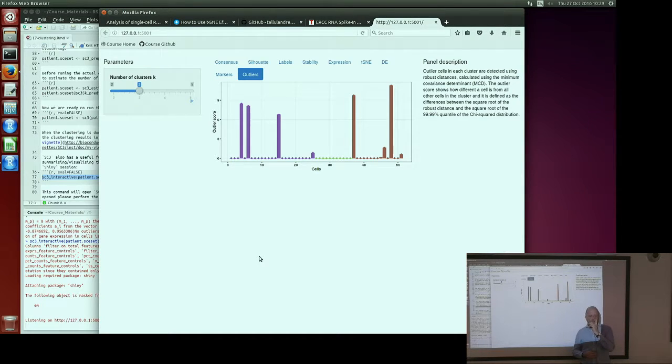So I think it's kind of a subjective opinion here. I think really one of the features of K-means clustering is that if you ask for 5 clusters, you will always get 5 clusters no matter what. And these methods are known to have problems with rare outliers and small groups. This is a way to help you identify those. In many cases, what this method calls outliers are probably quite benign, and there's nothing to be alarmed about.